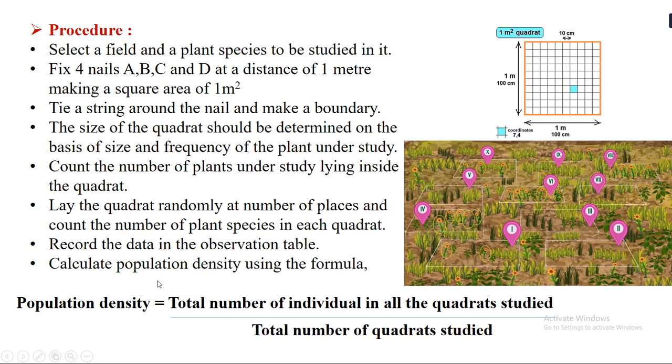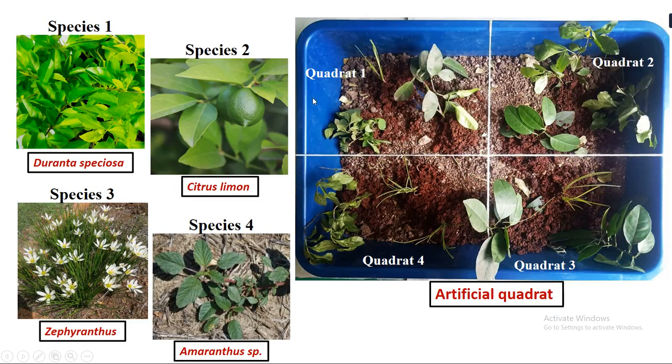Understood? So students, this particular experiment, as I told you, is field work. Here we are doing it in the lab, so I have made certain arrangements to study this experiment in the lab. What I have done is I have taken this tray.